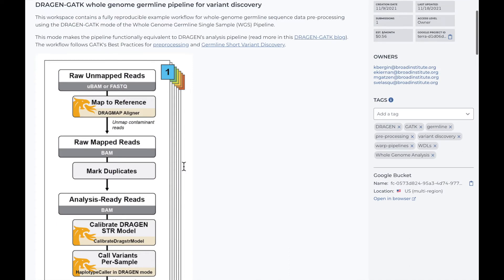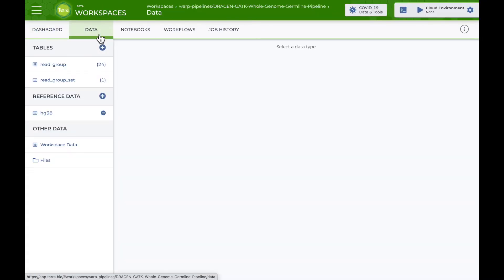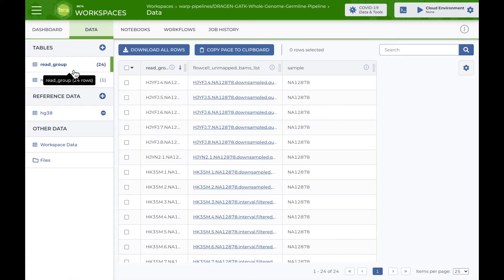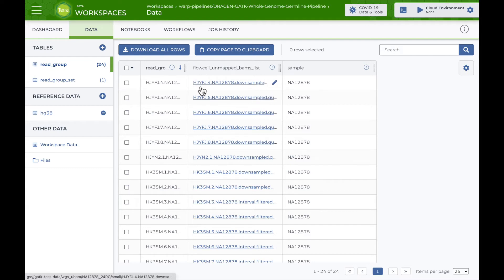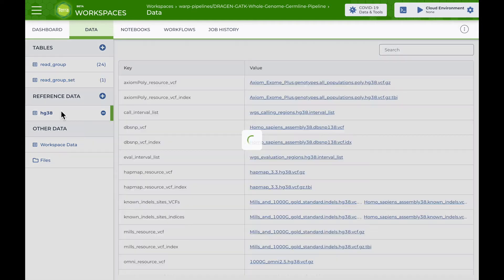Let's take a look at the other workspace pages. The data page contains sample data to run the workflow. The read group data table contains example inputs in the form of unmapped BAMs for multiple read groups. The read group set table organizes the different read groups into a single set, all belonging to the NA12878 sample. Reference data, like FASTA files and other metadata, are in the reference data table and the workspace data table.